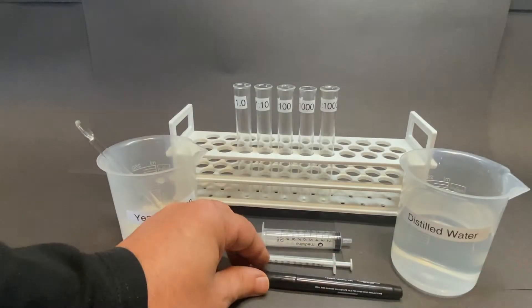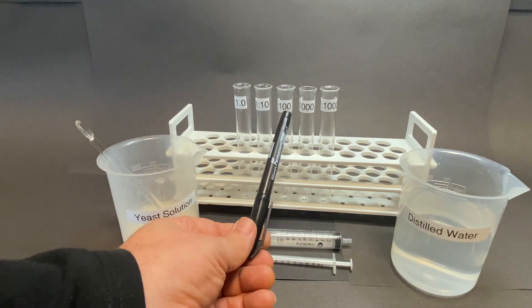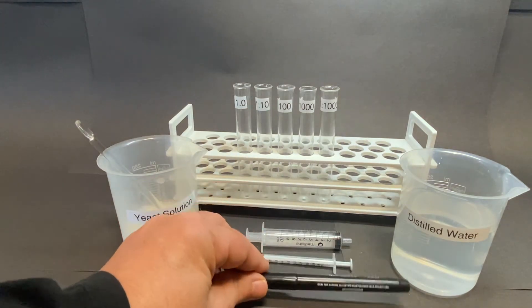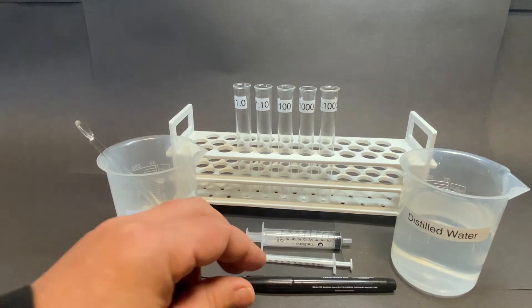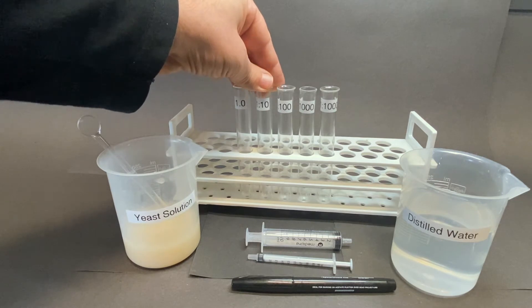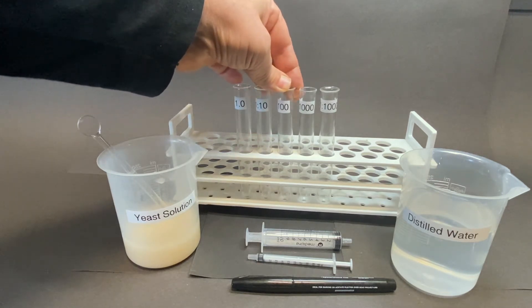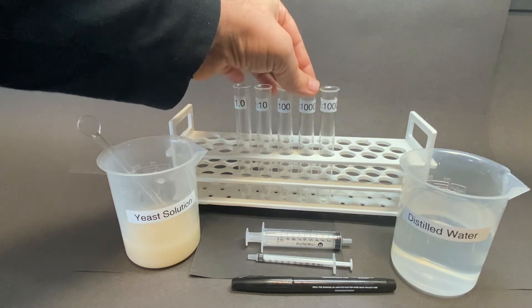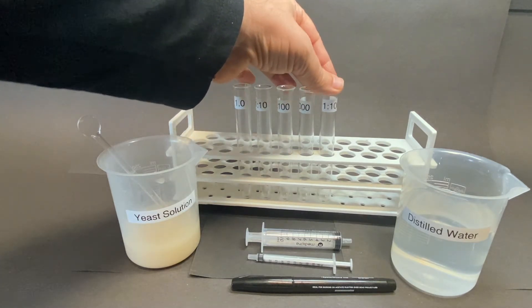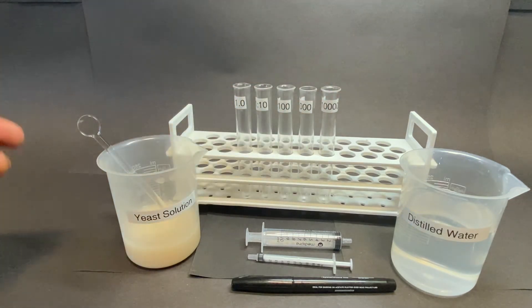Serial dilution. To carry out the serial dilution, the following basic equipment is provided: a 10-milliliter syringe, a 1-milliliter syringe, a marker pen, a beaker containing yeast solution, and distilled water to further dilute the yeast solution. A stirring rod is also provided in the yeast solution to prevent settling of the suspension. The test tubes and test tube rack should be clearly labeled using the marker pen.